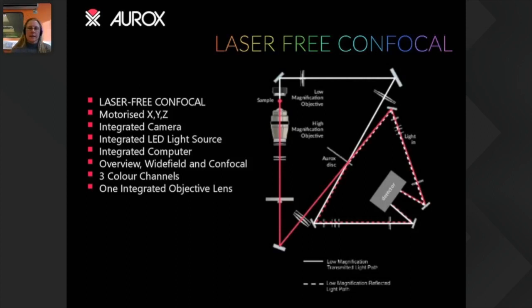Regarding the lenses, cleaning them is one thing to consider. If you're using oil immersion, we have some approaches to help people clean the lenses. Obviously, with dry lenses, you don't have a problem. The lenses can be completely removed for deep cleaning, and you can move them up and down in the instrument to access them for routine wiping. But again, we can discuss that with you maybe offline.